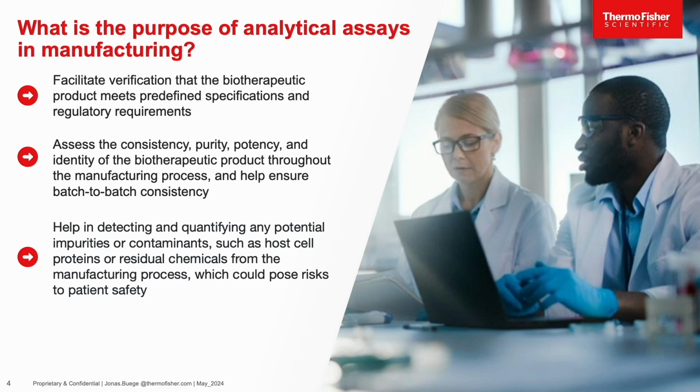So let's get started. When starting your analytical assay journey, it's prudent to start with a purpose. Within biotherapeutic manufacturing, analytical assays are the cornerstone of your quality control and quality assurance. There is a lot of weight on the analytical teams to develop solutions that facilitate the verification that the biotherapeutic product meets predefined specifications and regulatory requirements, assess the consistency, purity, potency, and identity of the biotherapeutic product throughout the manufacturing process, and help ensure batch-to-batch consistency.